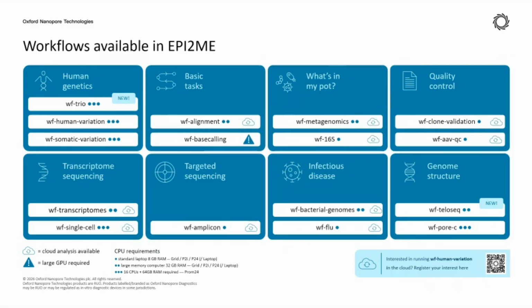But for long reads, because we are able to identify whether the variants are on the same DNA molecule, that means we can perform physical phasing. So we can perform the haplotyping or separate out different alleles without needing the parental information. We do not really need to have the parents' data in order to do the whole genome phasing. So with long reads, for samples where we want to identify the haplotypes, we can directly choose to use physical phasing.